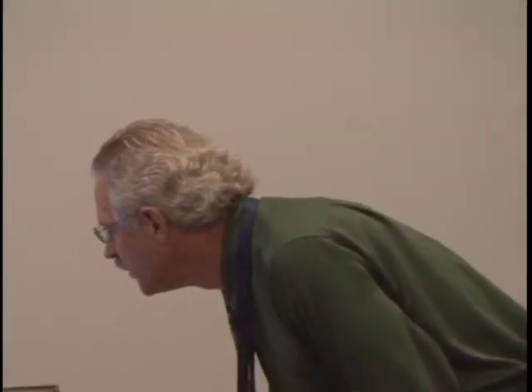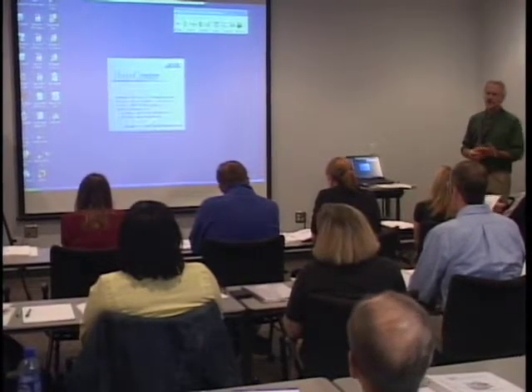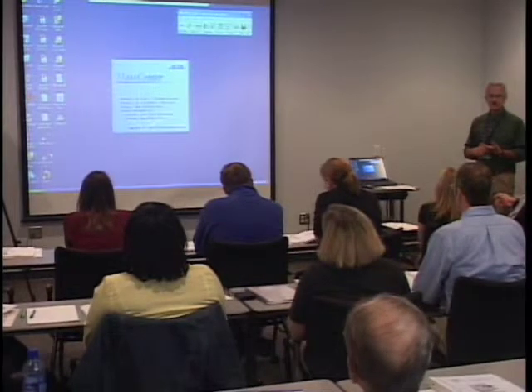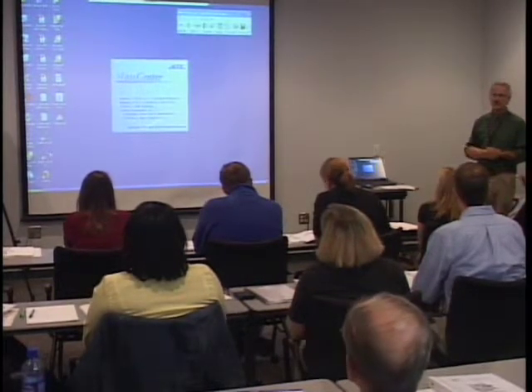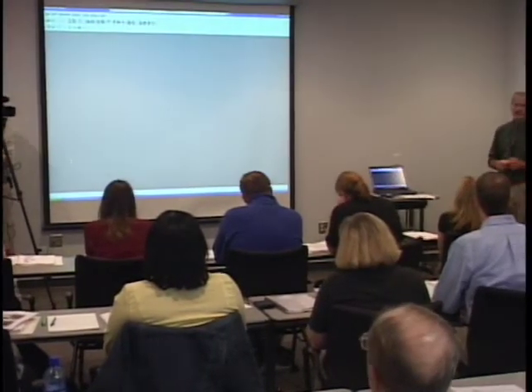We'll turn on the Mass Center main program, which is the mass spec control program. We'll use this for acquiring data and for turning the mass spec on and off, but we're going to use TSS Pro 3 Schrader software to process the data. It's just easier, faster, and more intuitive.